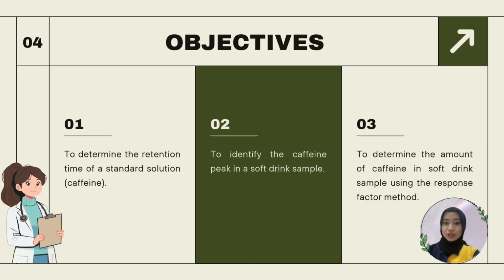Next, I will continue with the objective. The main purpose of this experiment is to determine the retention time of a standard solution, caffeine. Besides that, to identify the caffeine peak in a soft drink sample, and lastly, to determine the amount of caffeine in the soft drink sample using the response factor.